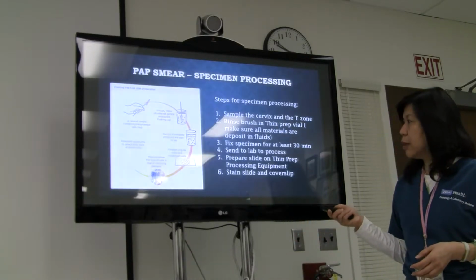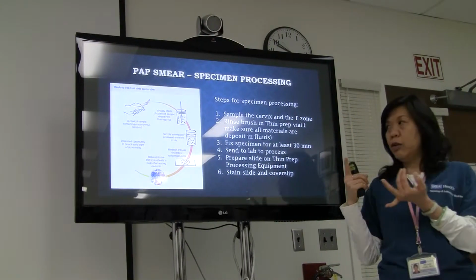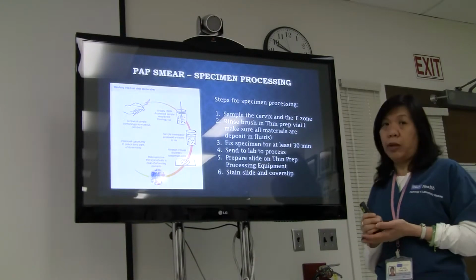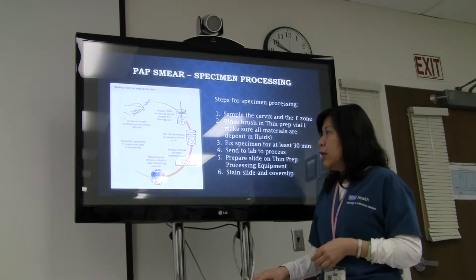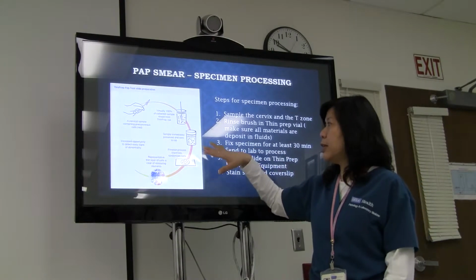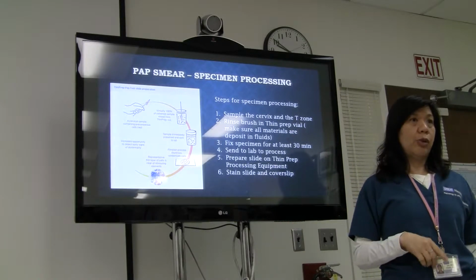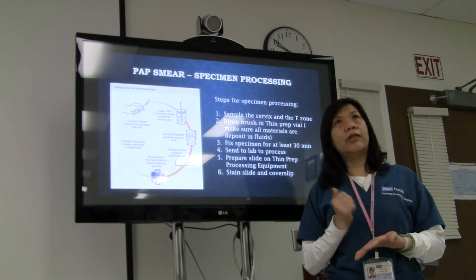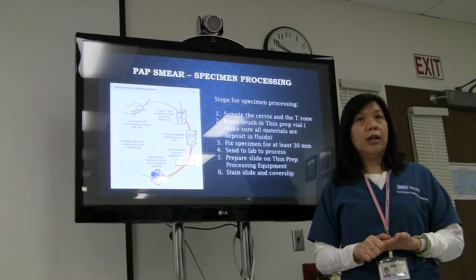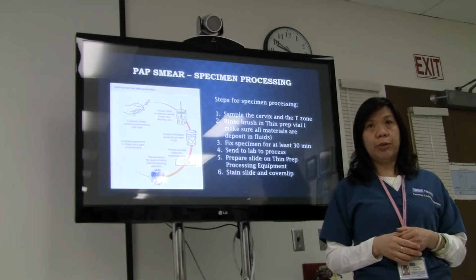In contrast, for this one, you need the whole set of fixative solution, you need a whole set of expensive machines and special slides to do it. But you have a better result. So 95% of laboratories or hospitals in the US or in Western society are using liquid-based prep, compared to conventional prep. However, a lot of the developing countries in Asia, South America, or even Africa are still doing the conventional way because it's much easier and much cheaper. Okay?